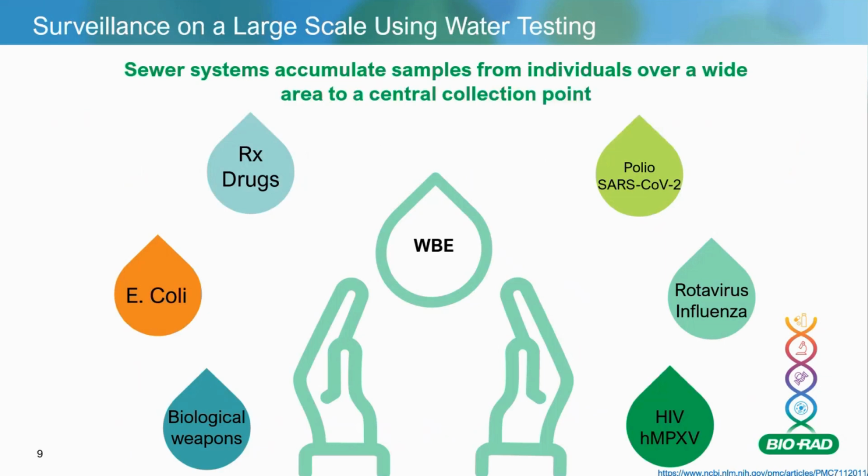Now, if we look at wastewater-based epidemiology, it's really utilized to give comprehensive health information on a community. So the concept is primarily based upon the extraction of a sample from wastewater, and then analyzing and interpreting that sample, looking for either some sort of chemical or biological compound in there, and these are referred to as a biomarker.